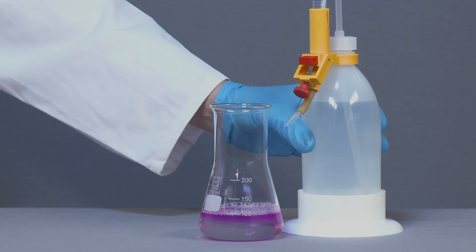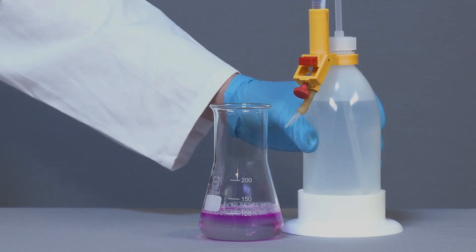The zero point must be adjusted before starting the titration. Firmly squeeze the bottle once and release it when the liquid level is above zero. The zero point is set.